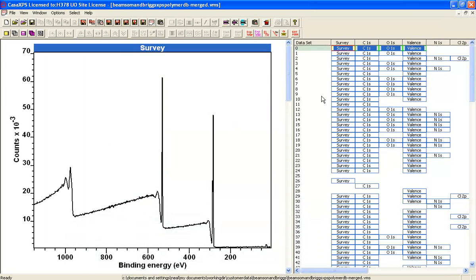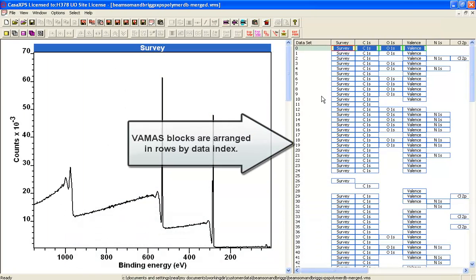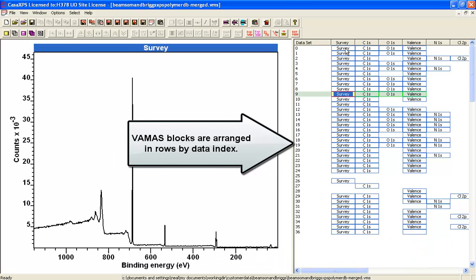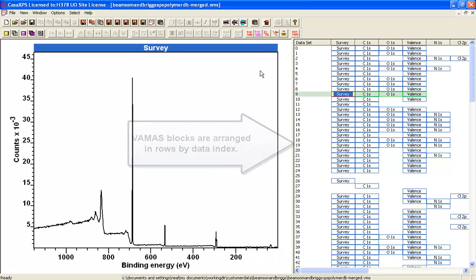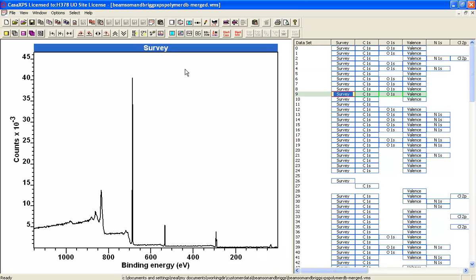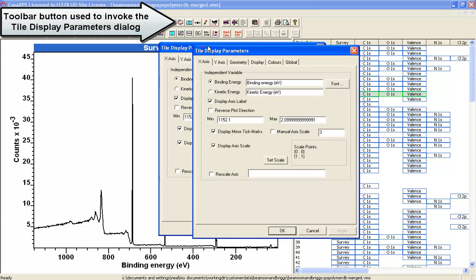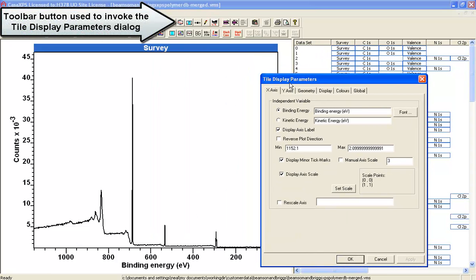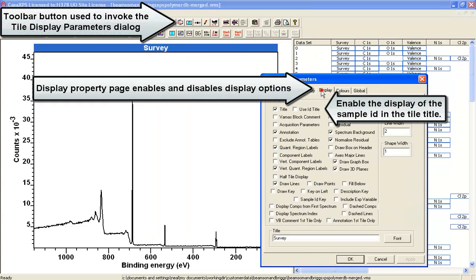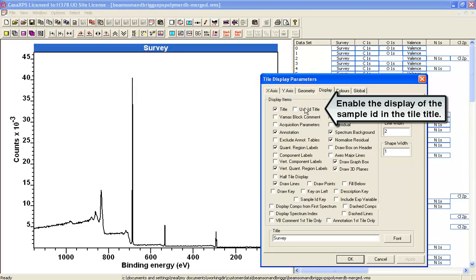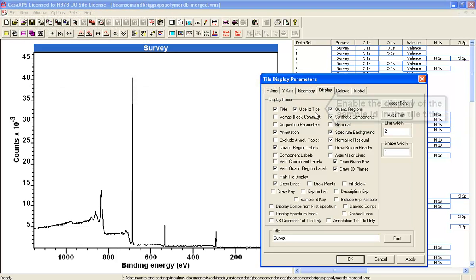So the data are arranged and you can see all the survey spectra which you can search through. Let's see how to identify which sample these survey spectra are coming from. On the display property page of the tile display parameters we've got use ID in the title.